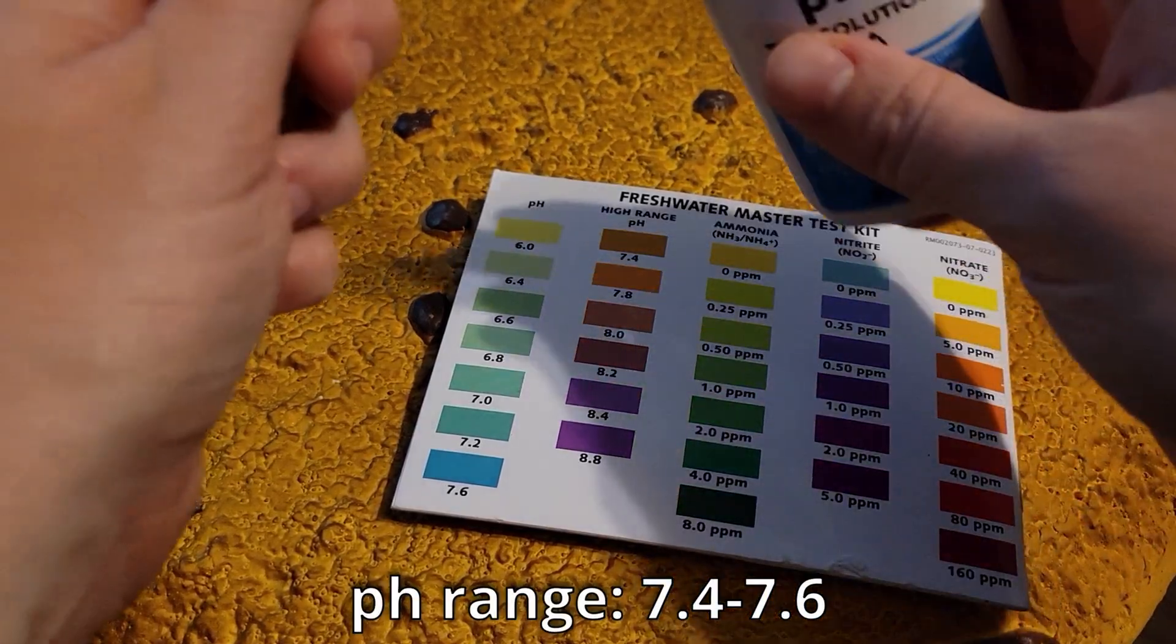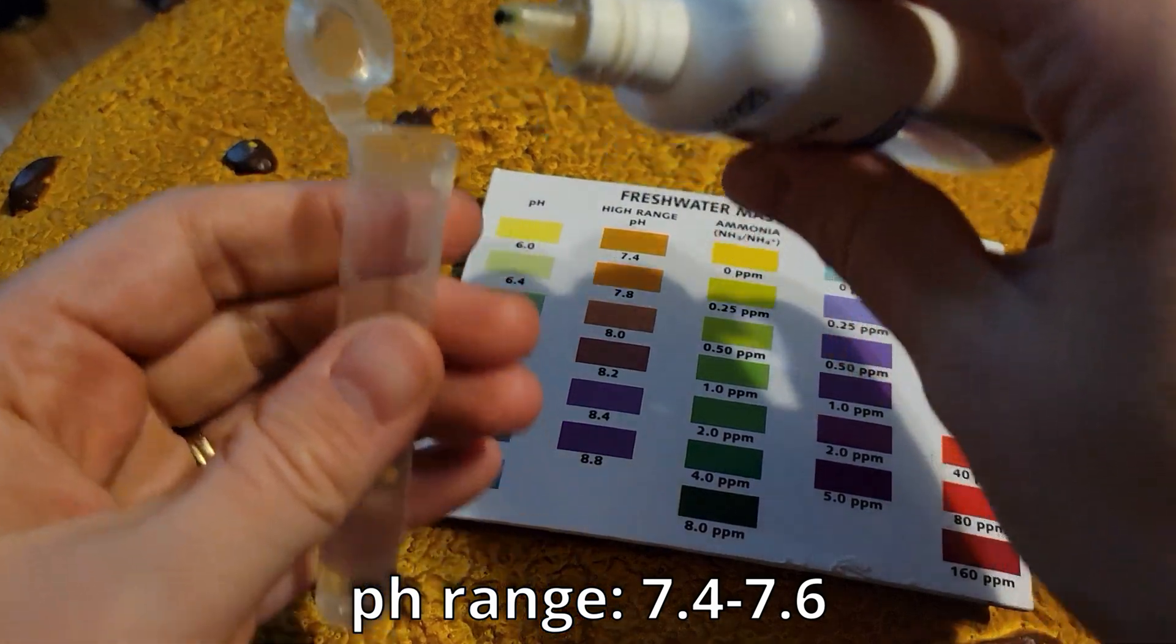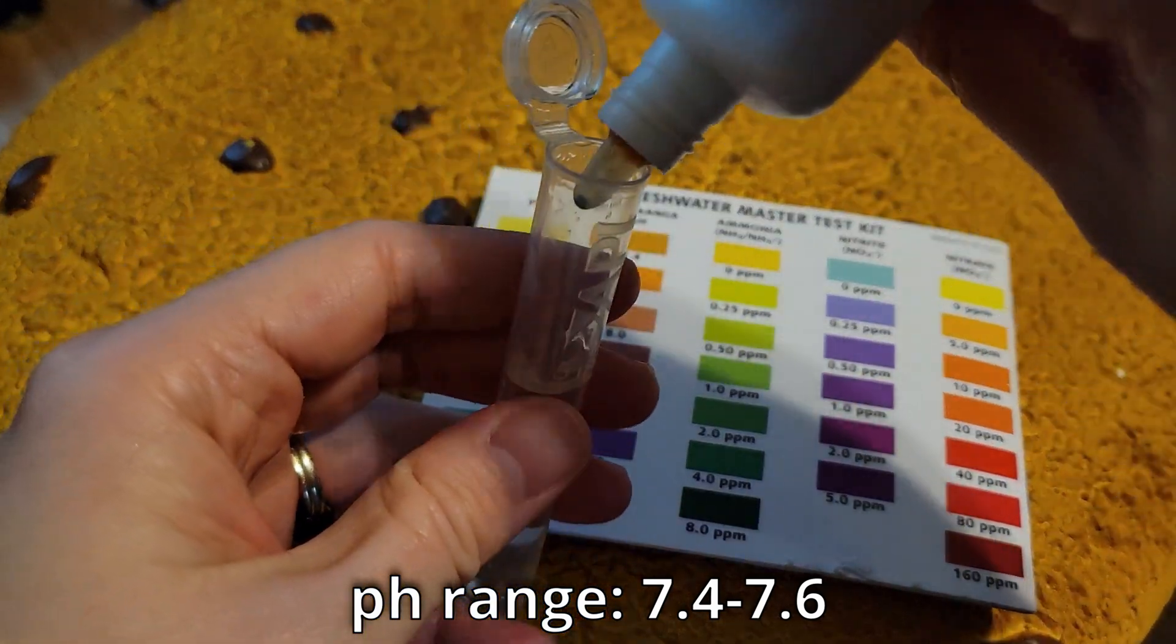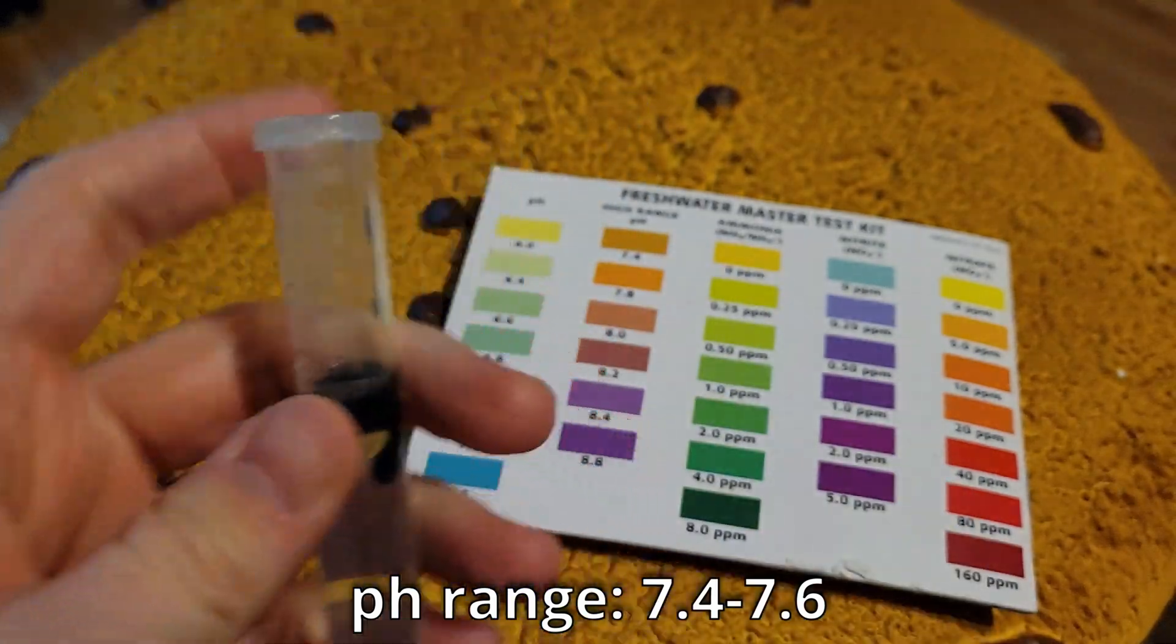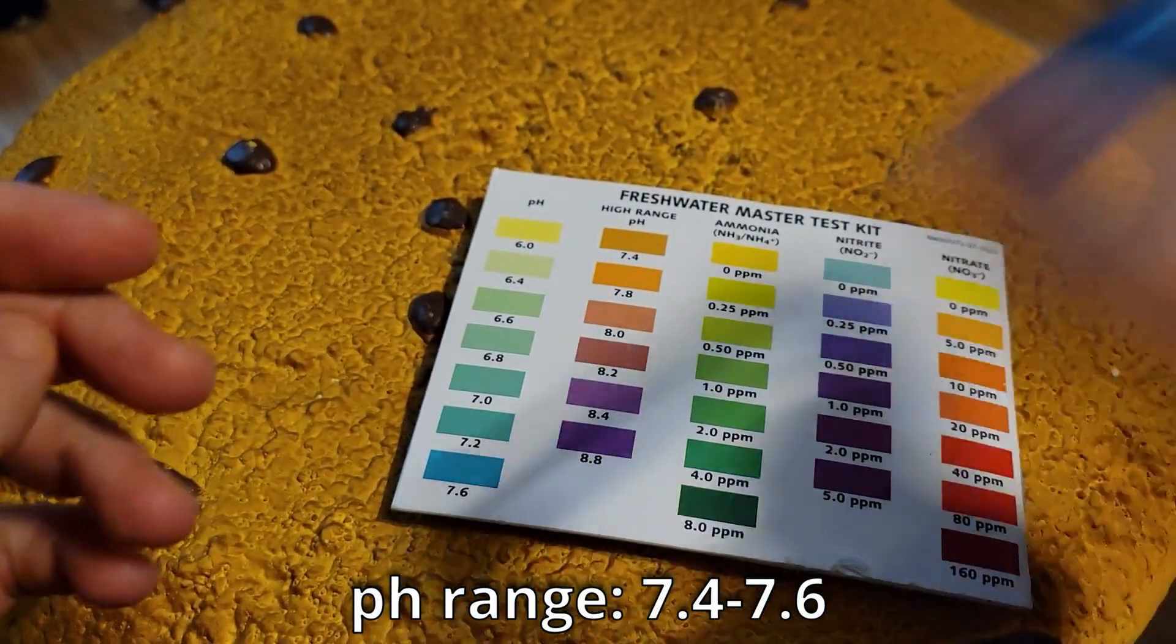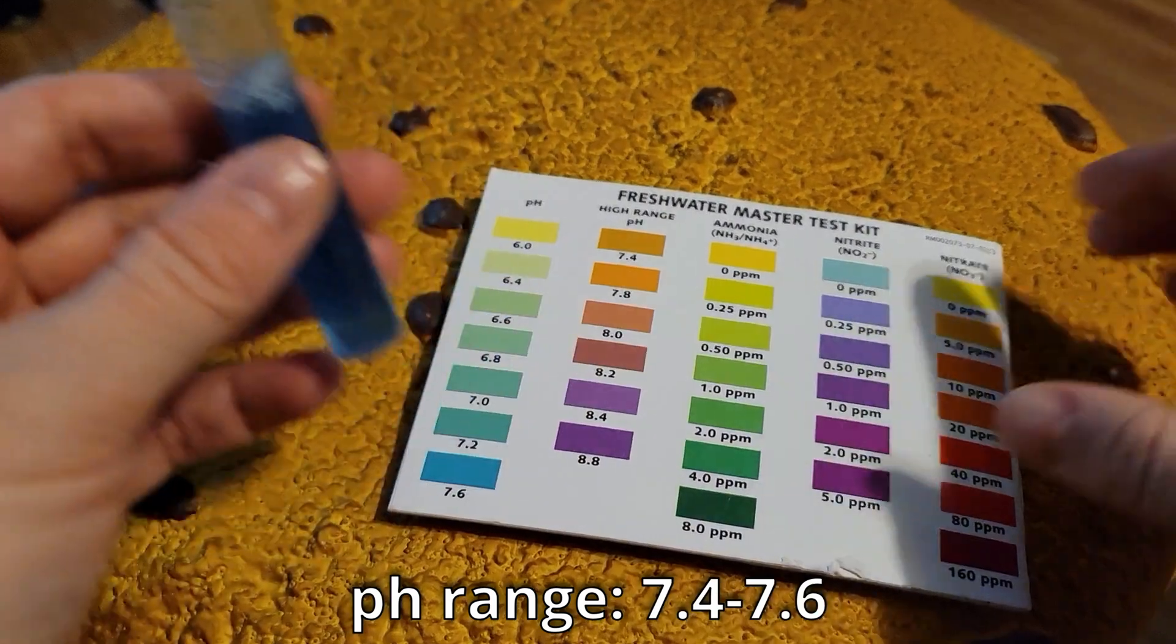So we are going to start with the pH. For this, you are going to add three drops into the test tube and then you shake the test tube up. After it is shaken up, you wait five minutes for the test to develop and that is when you compare it to your chart.